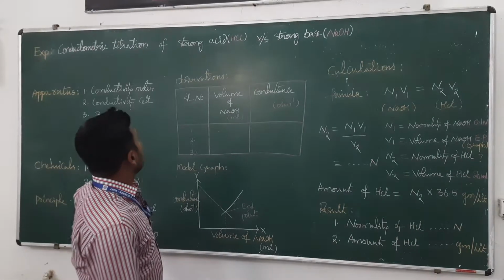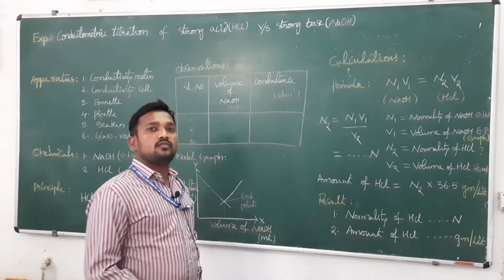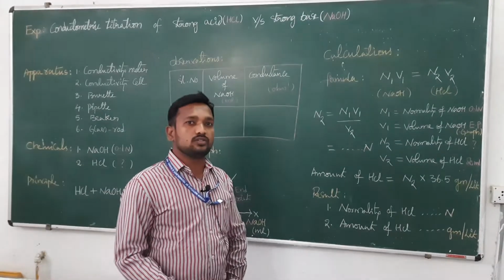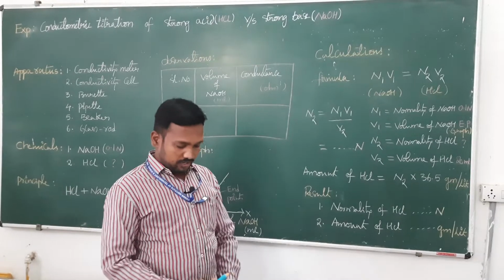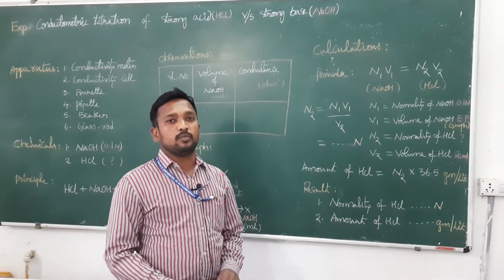What is meant by conductometry? Conductometry means determining the end point of acid-base titrations with the help of conductance values. This is known as conductometry.